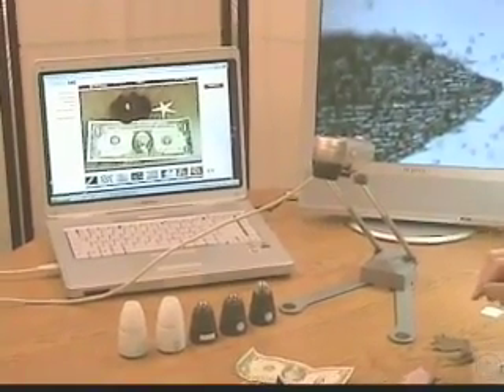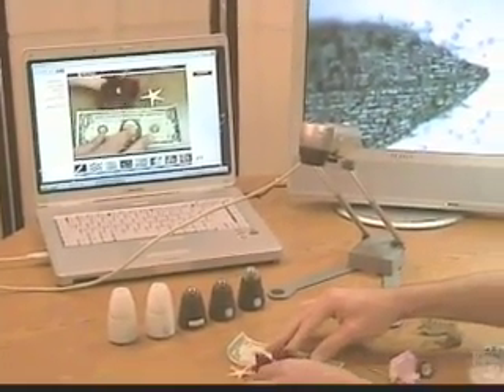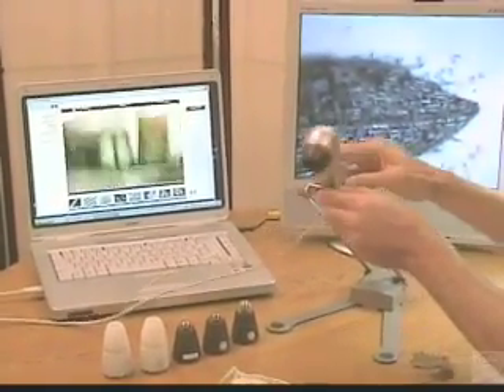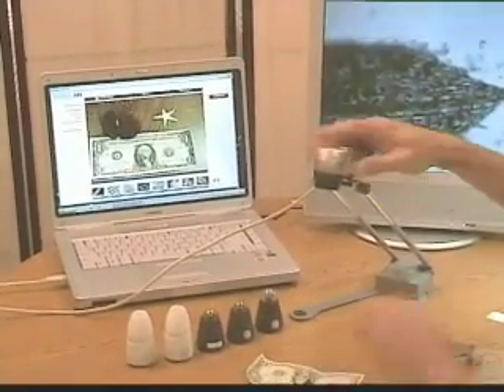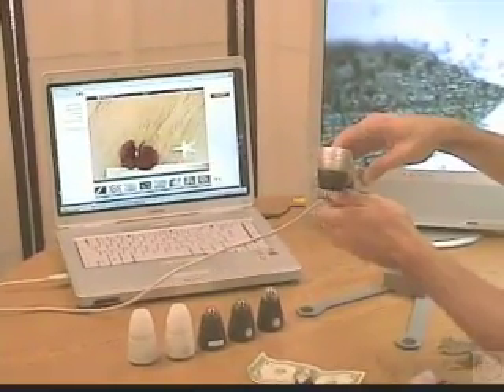The first is the Stand and View mode. You can put the ProScope on this optional stand and then display any object or point it out across the room for a presentation, or use it like a dissecting camera or a document camera. This is kind of manual focus, so you can zoom in directly on any object you want to view.